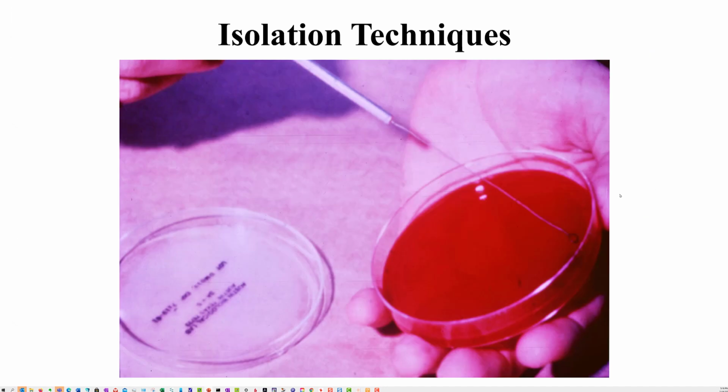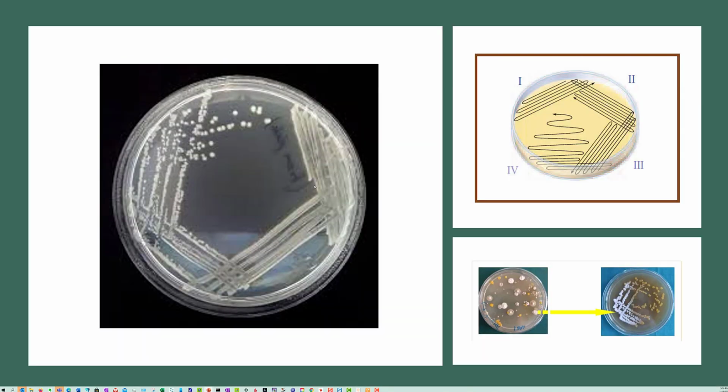I did want to review one more time the single colony isolation technique. First of all, you should have gloves on those hands, but anyhow, when you're streaking, you follow a particular streaking protocol. I like the 4 quadrant streak, 1, 2, 3, 4, and the fourth one I kind of use more space. The idea is you want to get these single colony isolates. The reason being is I want to make sure I'm not dealing with a contaminant, or is it a mixed culture? What can I see from this? And if I do take a sample, I usually try to pull from the same clone or the same colony every time. But typically, it's a good self-check on your technique to see if you've got a contaminated culture or not.